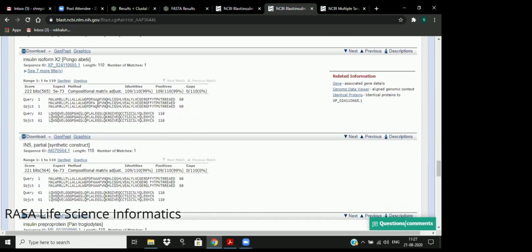Obviously, this is the result. This means that there is no relationship which could be established between A and Q. Neither is it identity, neither is it similarity. That is why they have written nothing. Since it's a local alignment, BLAST tries not to throw multiple gaps in order to attain the alignments, because they could find that all the other alignment was so nicely done. You can see that there are 109 identities out of 110, right? So that is why they have not thrown a gap and disturbed the entire alignment. They've just shown no result for A and Q.